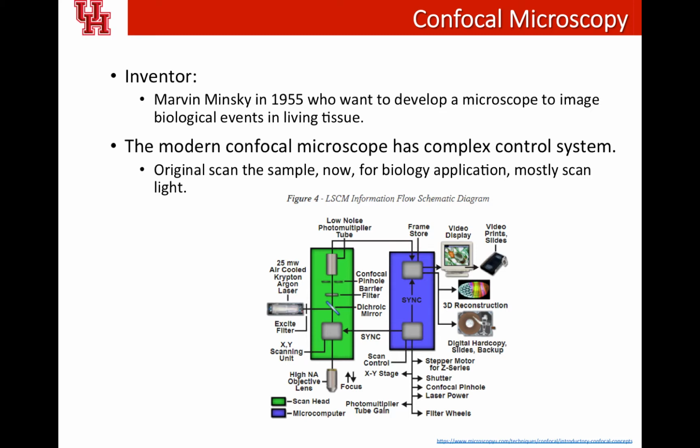The advantage is that you don't need to change any optical pathway, so the optical pathway can stay steady and optimized, and you only move your sample.